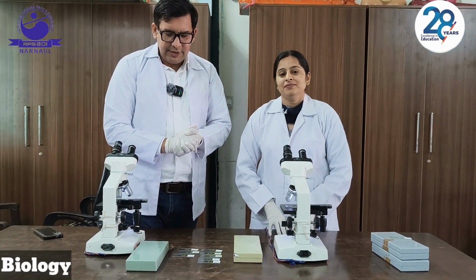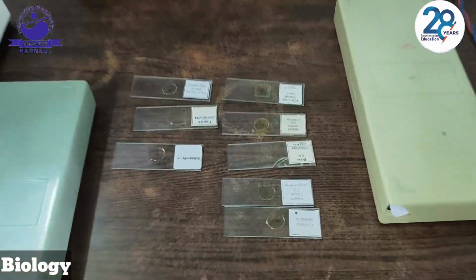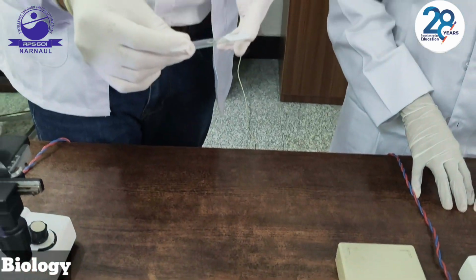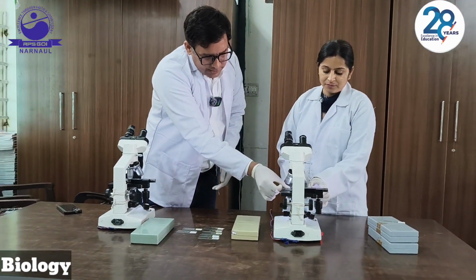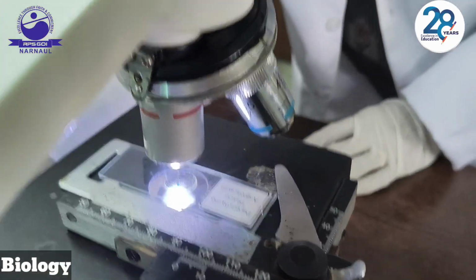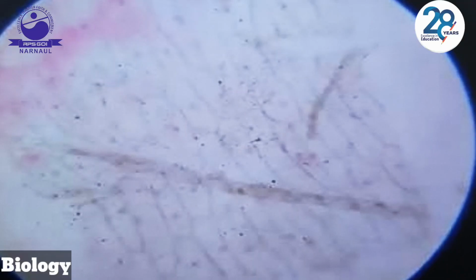Okay students, now we are in the laboratory and we are going to observe all the permanent slides of the tissues one by one. First, we are going to observe the parenchyma tissue. Ma'am is going to observe this tissue and side by side I am going to explain it. This is the parenchyma tissue. Dear students, this is the parenchyma.